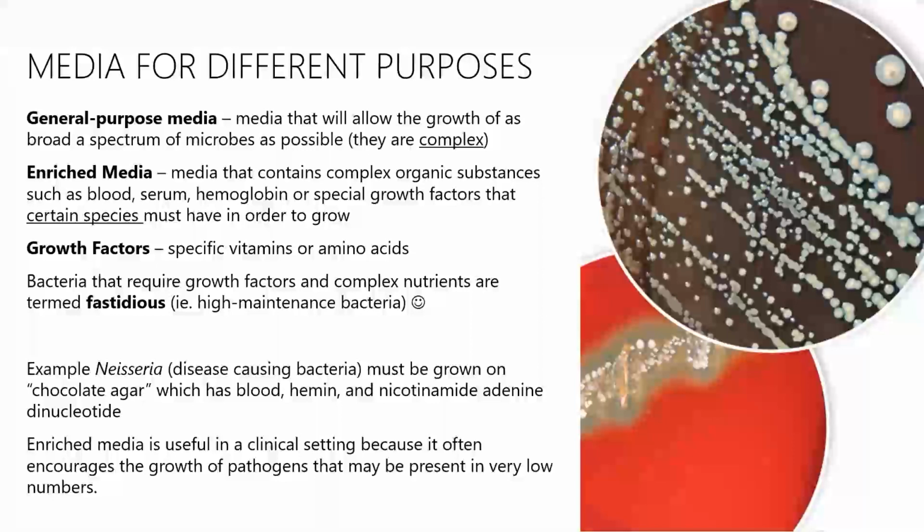So maybe we have a blood agar down here. Maybe we're going to put our patient sample on it, and we're only going to collect the colonies that make little clearings here in the red agar to find the ones that can digest blood because our patient has some sort of blood disorder, okay? Or maybe we're going to be thinking about what growth factors are important. So if we want to see which microbes need which amino acids or vitamins, we could also have that goal.